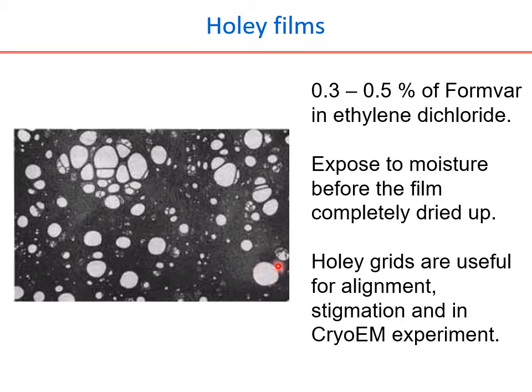So if you just look at this arrangement, any protein that is trapped here and frozen will reveal to us the true or the native conformation of the protein, and any analysis of this particular view of it will reveal the native conformation of the protein. So that is one unique advantage of the Holey film.